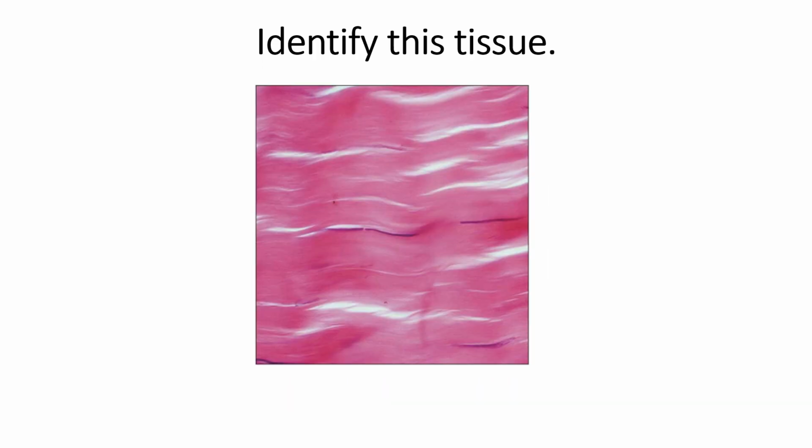For this type of tissue, right? Walk through those steps again. It's not nervous tissue. Could it be muscle tissue? Do we see clearly defined cells that could be any of the three types of muscle tissue? No, right? We don't see like the rectangular shaped cells of cardiac muscle, skeletal muscle, and we don't even see the elongation of the cells that are in smooth muscle. So it's not muscle.